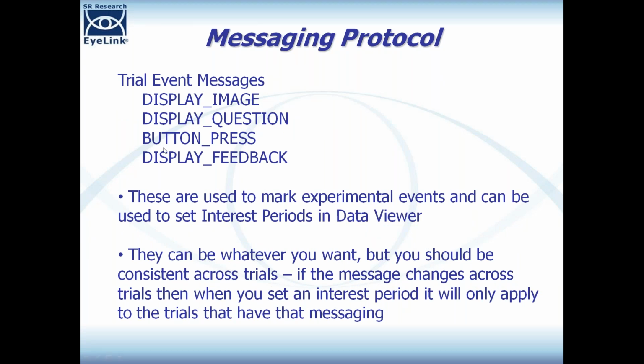Then as our different experimental events occur, we're of course going to send trial event messages. These aren't technically Data Viewer integration messages, but you're going to need them in Data Viewer. Throughout a given trial in your experiment, you're going to be recording eye movement data continuously, and you want to mark the time when these different experimental events occur.